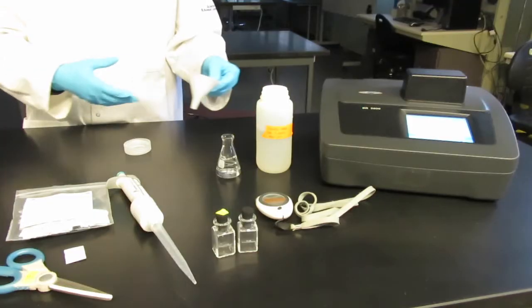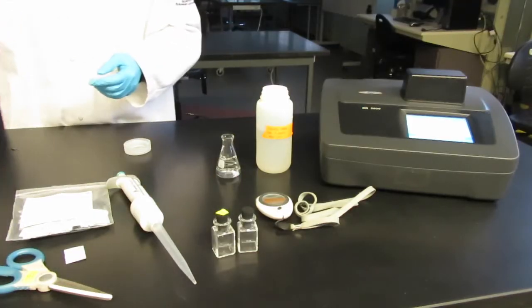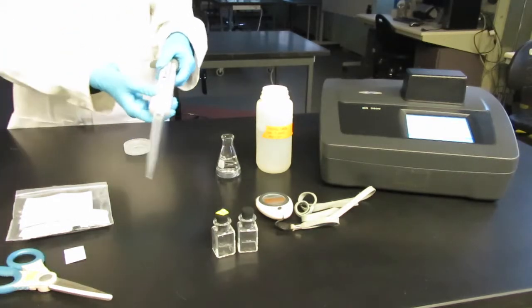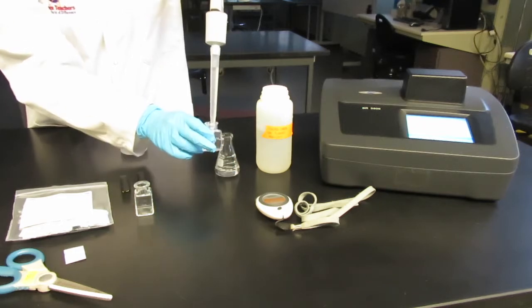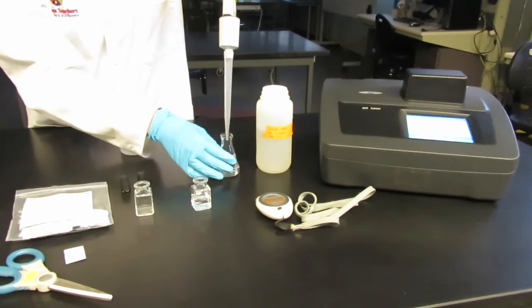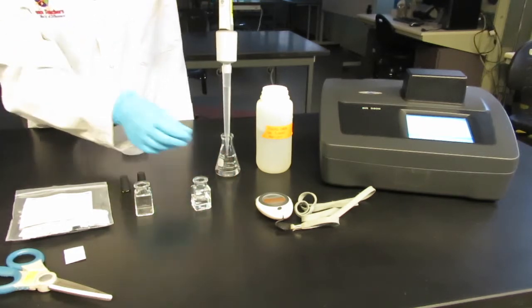Using a 10 milliliter pipette add 10 milliliters of the filtered water sample into two of the square cuvettes. One will be your sample and one cuvette will be your blank. Make sure your stoppers are labeled.